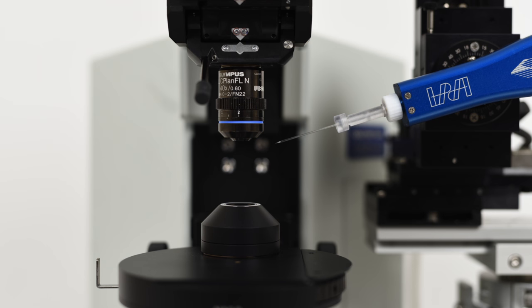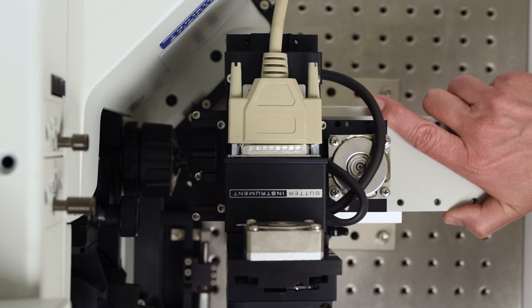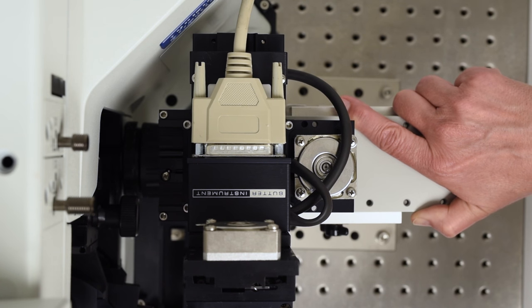As you can see, the manipulator is now short of reaching the objective. With the Sutter MT75 tower, you can simply slide the gantry toward the objective to set the correct working distance.